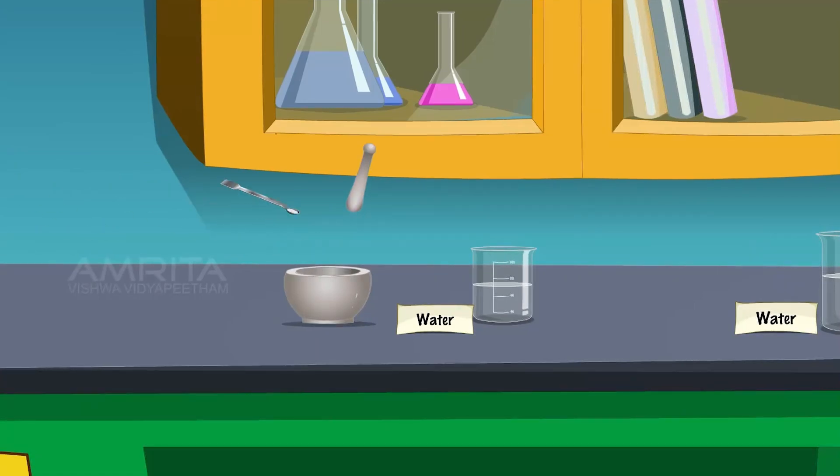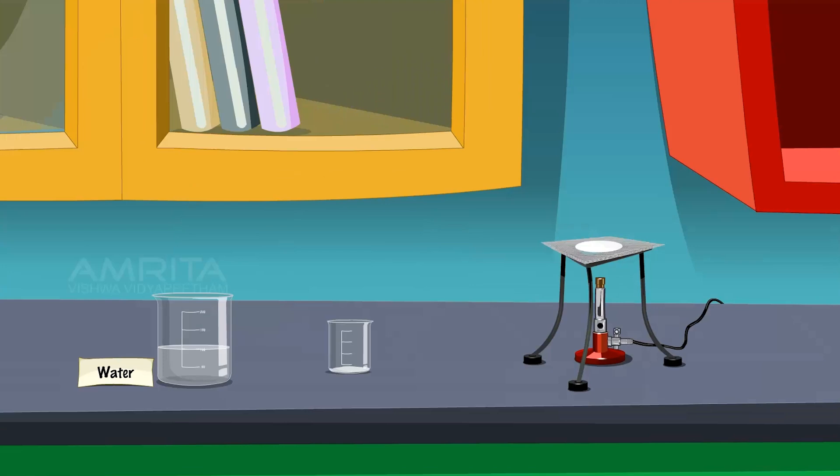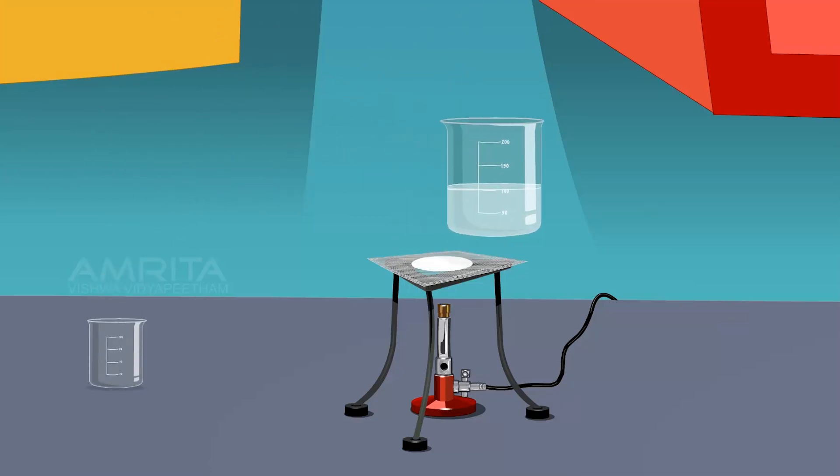Transfer the paste to a 50 ml beaker. Take about 100 ml of distilled water in a 250 ml beaker and heat the beaker so that the water starts boiling. Pour the paste slowly into the boiling water with stirring using a glass rod. Continue boiling for about 10 minutes and then allow the beaker to cool.